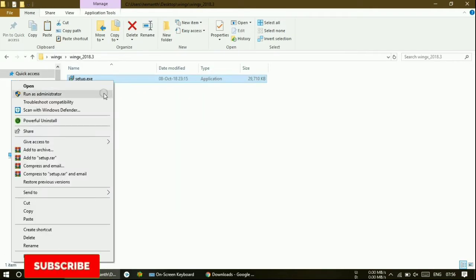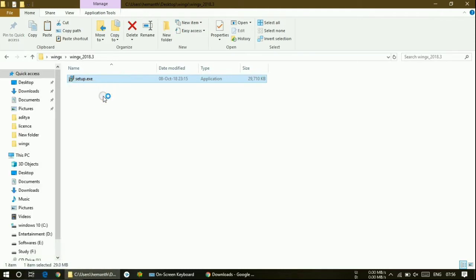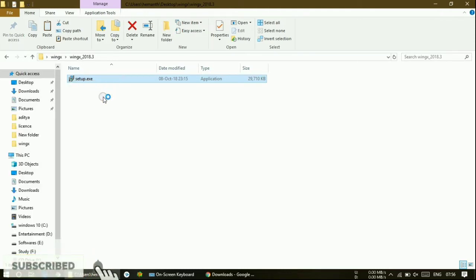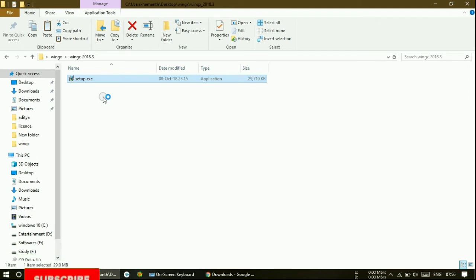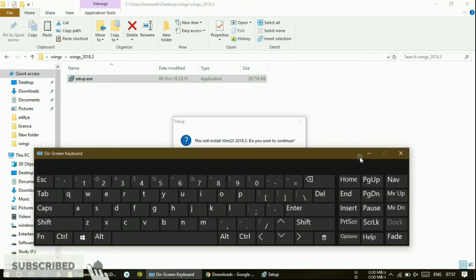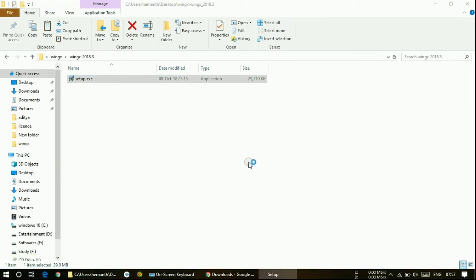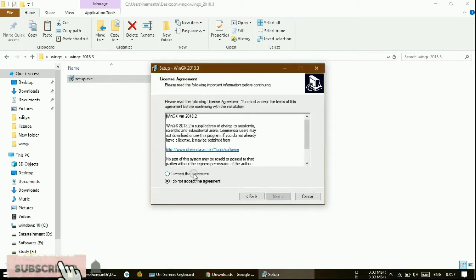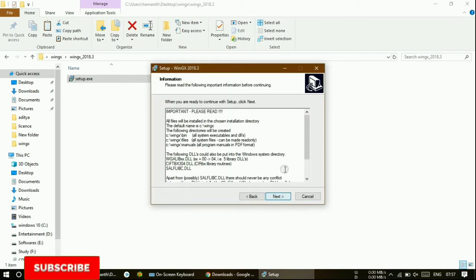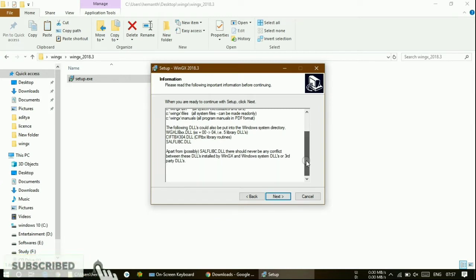Install by clicking 'Run as Administrator'. I am just running it, I am installing. Now the software is being installed. Accept the license agreement, and here they will give you some instructions.